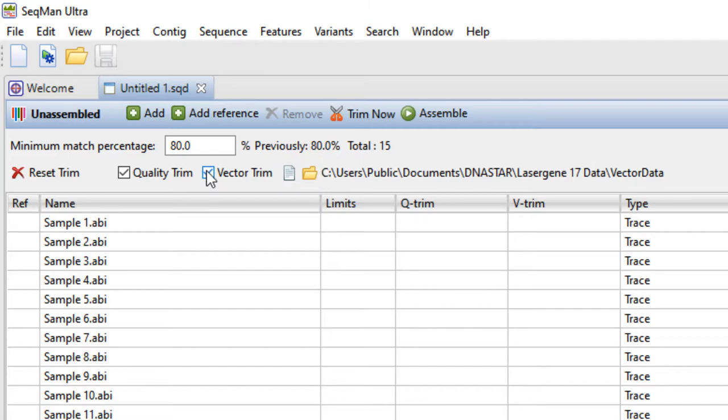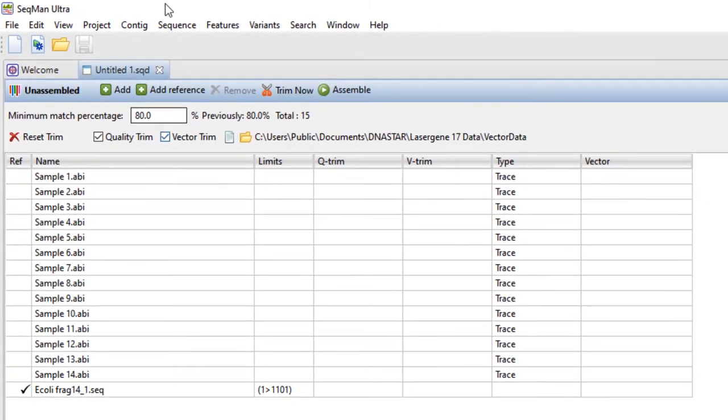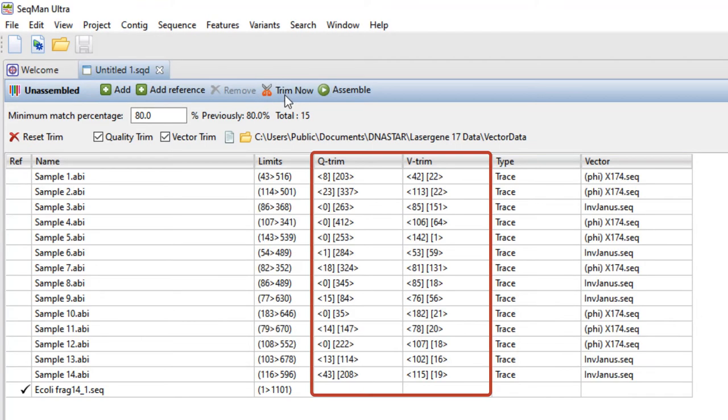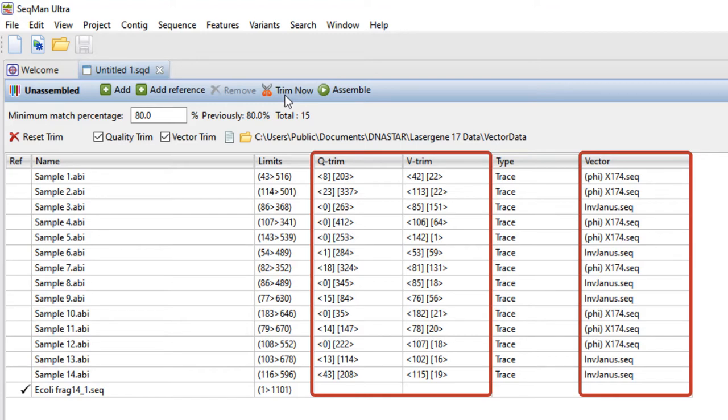If you did check the Vector Trim box, press Trim Now to perform trimming. Quality and vector trimming results, along with the names of any located vectors, will appear in the table.